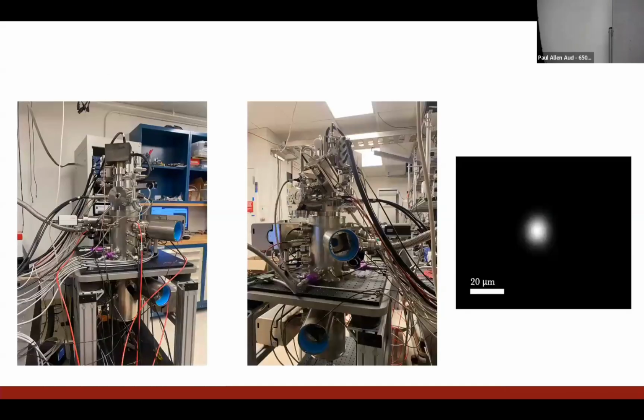So this is what the instrument looks like in the lab. It's a totally custom column. The gun is built by DeLong Instruments, which is a Czech company. The rest of the column and the electron lens stack by Kimball Physics. It's got way more elements than I'm looking forward to controlling. One thing you should see is that these big cans here are the high-speed transmission lines that basically do this pulsing. So the inside of these are biased up to about 10 kV, and then we'll generate these about 100-volt pulses on top of that to bring the electrons in and out of this re-imaging device.